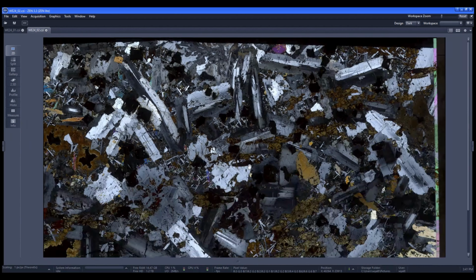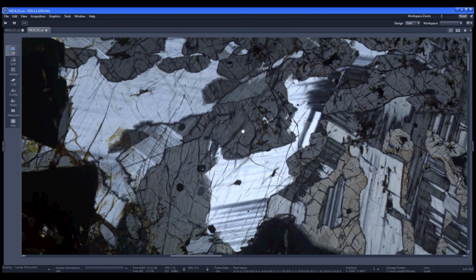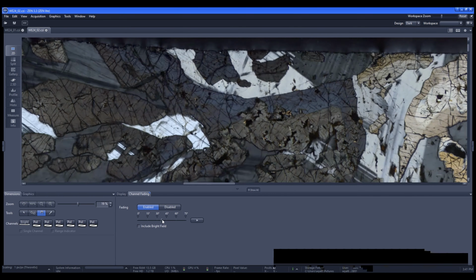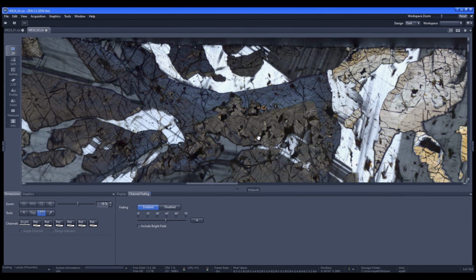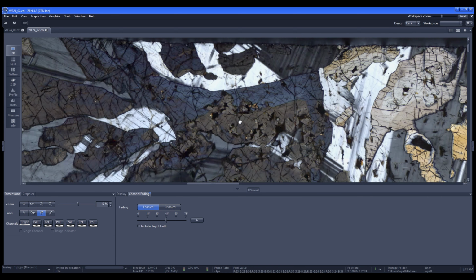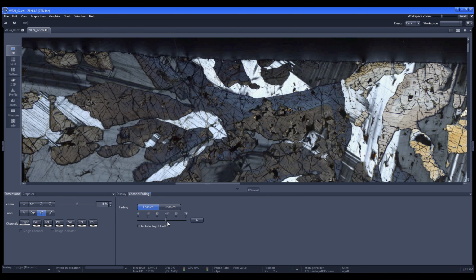And there's actually one other mineral I want to show you here. And it's right up here. It's this mineral here. Now, this might look like a pyroxene initially, but it's not. It was kind of hard to spot, but somewhere in here, you can actually see two different cleavages, and they intersect each other roughly at 120 to 60 degree angles. And that's something that occurs in a mineral called amphibole. So this is some type of amphibole mineral.